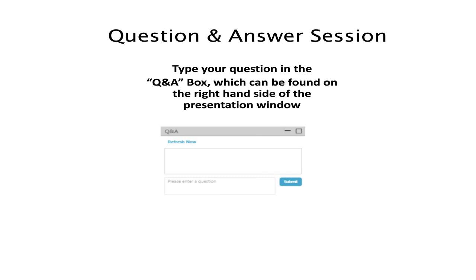Next question is, let's say I receive a paint chip with multi-layers, translucent coating, dark coatings, and one epoxy layer. How accurately can I measure this system or similar systems? Something that I would suggest here is that a cross-section be taken of that paint, because to get detailed analysis of layer thickness, the paint would need to be presented to the microscope in a cross-sectional format.